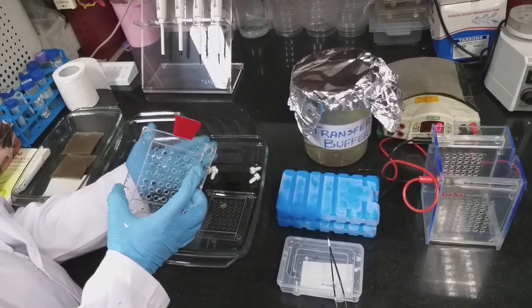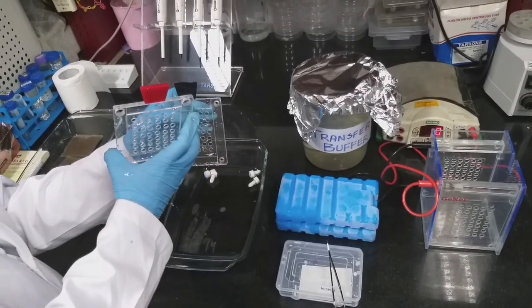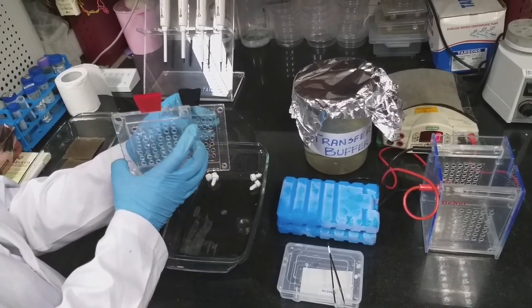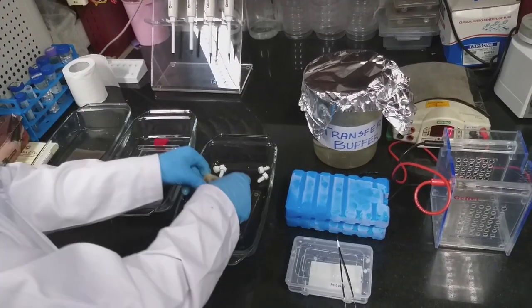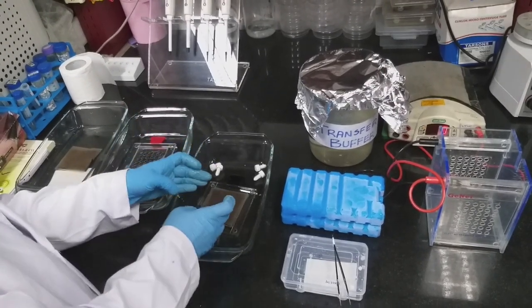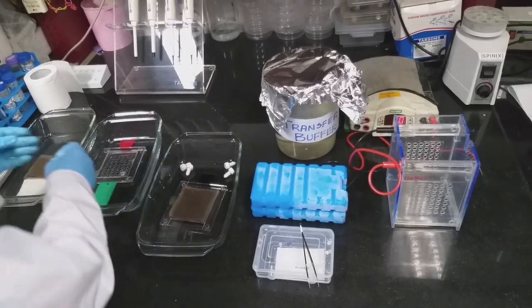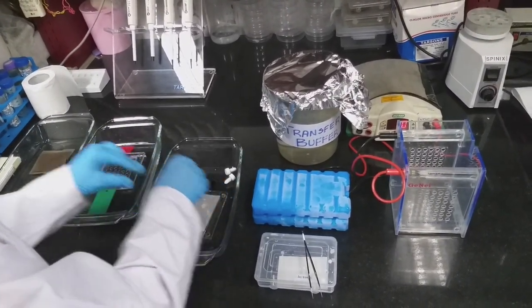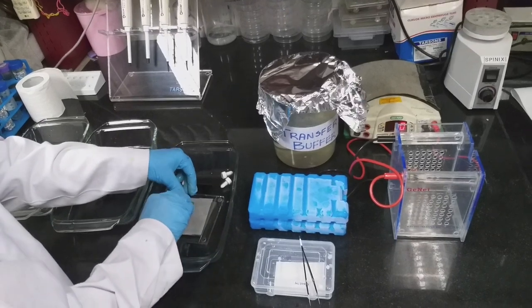So when we apply voltage from this side to this side, the negative protein will be moved to the positive side and it will be captured in the membrane. First, for doing that, these sponges we need to keep, and they may give some non-specific binding to the membrane. So what we will do, we will put blotting sheets on top of this. After this, you have to remove air bubbles if any are present.